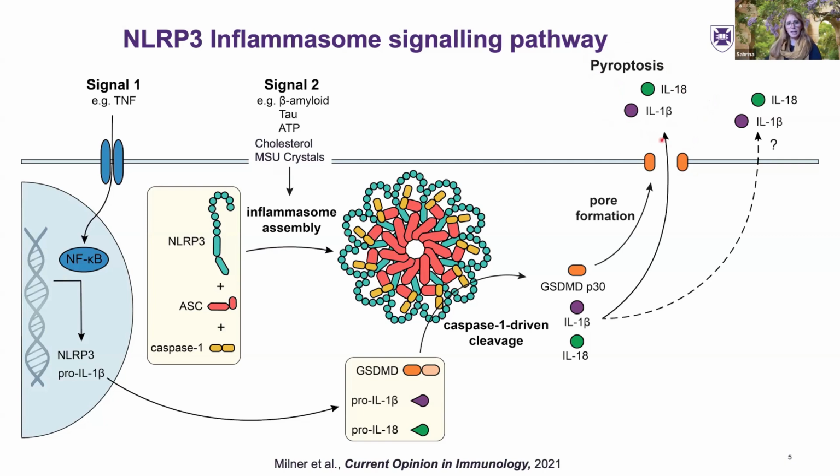What I would like to show you today is three different ways how we assess this whole pathway to see if an inflammasome is formed, or especially an NLRP3 inflammasome. The first one, which I mentioned before, is this ASC speck formation, so how we can assess if an ASC speck forms in a cell. The second part will be about pyroptosis. Can we measure cell death in cells that are inflammasome activated? And the third one is kind of a combination of everything, to see how this is actually important in infection, so how this really helps to protect us from an infection.